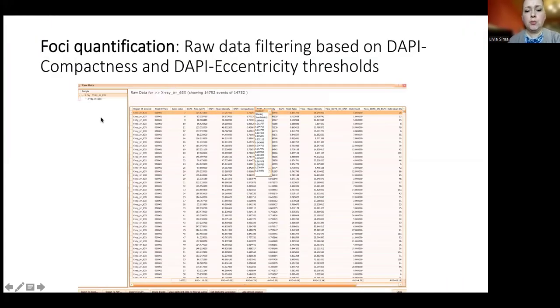In order to be able to obtain a statistical significance comparison of data, we have to export the numerical values from the TissueQuest in order to import them in other software like GraphPad to generate a graph of the data and to measure statistical significance.